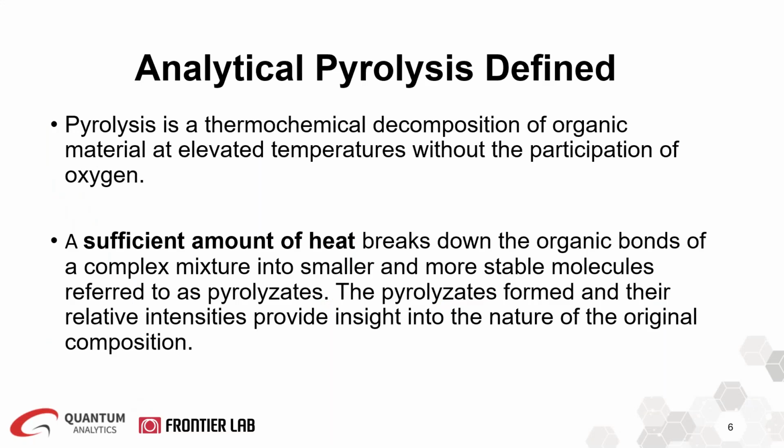So a very common question that we get is, what is pyrolysis? By definition, pyrolysis is a thermochemical decomposition of organic compounds at elevated temperatures without the participation of oxygen. Typically, you use an inert gas such as helium, and you apply a sufficient amount of heat to break down the organic bonds of a complex mixture into more stable molecules referred to as pyrolysates. Now, these pyrolysates formed and their relative intensities provide insight into the nature of the original composition of your sample.